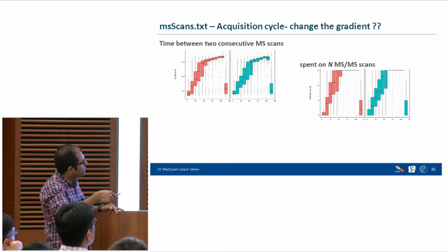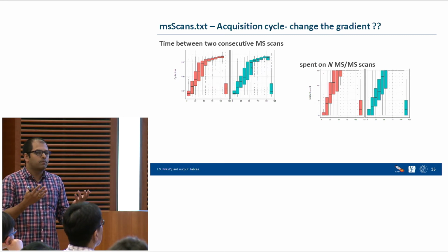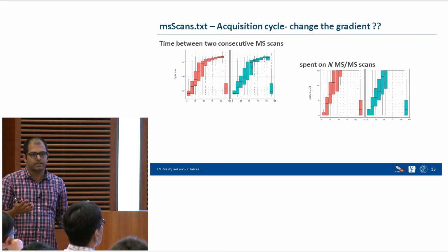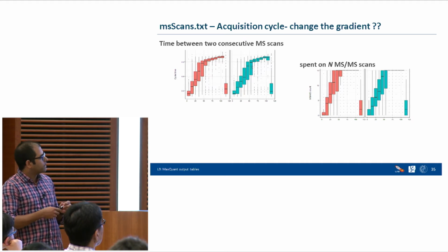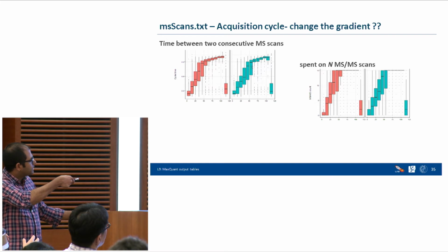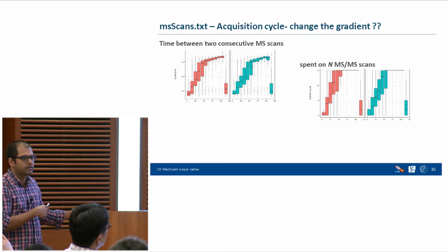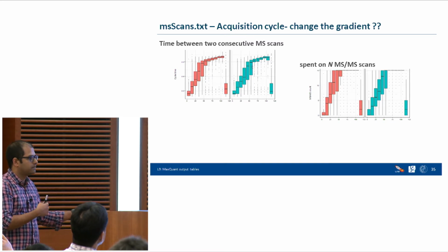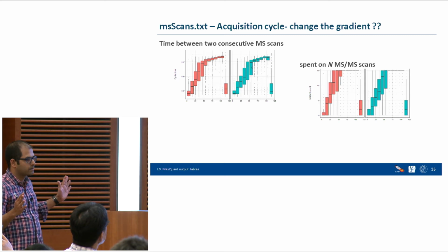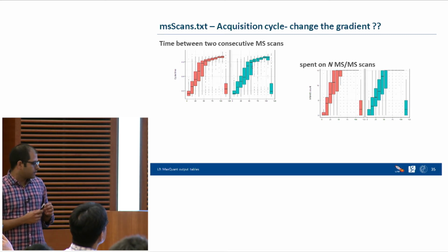And the reason why the number of MSMS scans is low is probably because the actual population of peptides that are eluting at that time is smaller, right? Which kind of indicates that we probably have a suboptimal gradient, where there is nothing in the beginning and then suddenly it starts to rise. Which means the first 25 minutes is actually a waste of time in this particular gradient. So we actually have to change the gradient so that we can make use of the full machine from the beginning till the end, right? So that's another example.